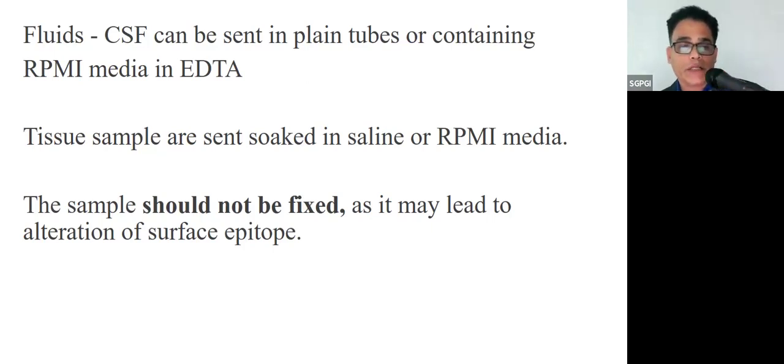The only care that should be taken is that you should not use a fixative for the tissue sample or FNA, because you will lose your phenotyping. Some of the markers will not work once they get fixed.